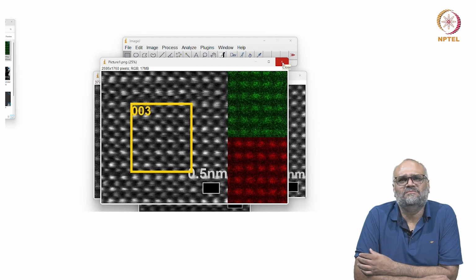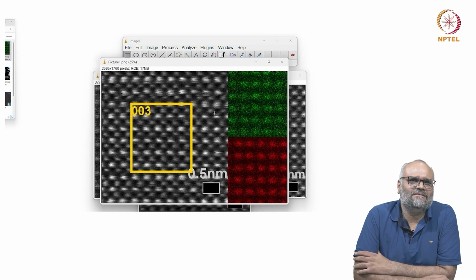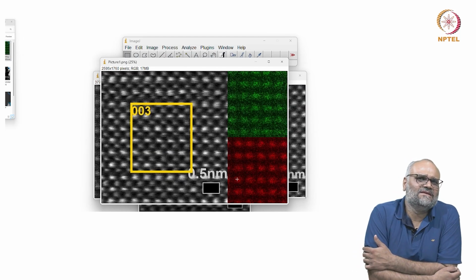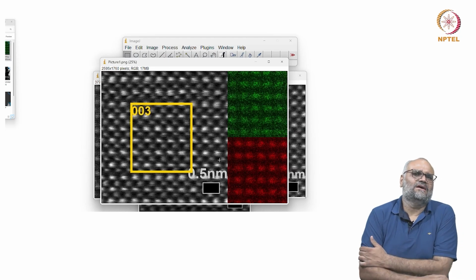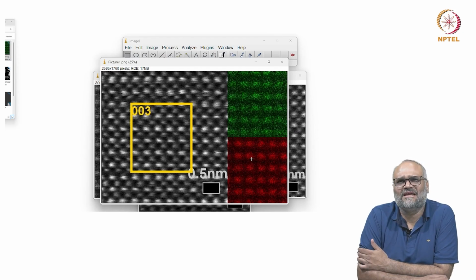It is important that when you're using more than one image in a panel, so here you have a larger field of view and these two are slightly smaller fields of view, and we didn't change the magnifications or anything. So having a scale bar in this particular image here and not having a scale bar here doesn't look that nice.